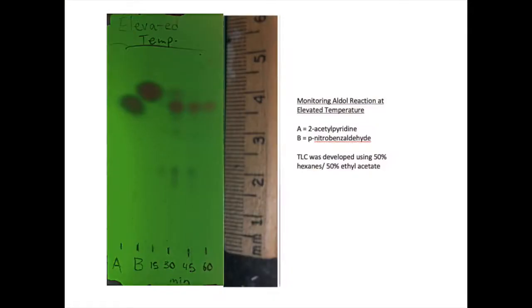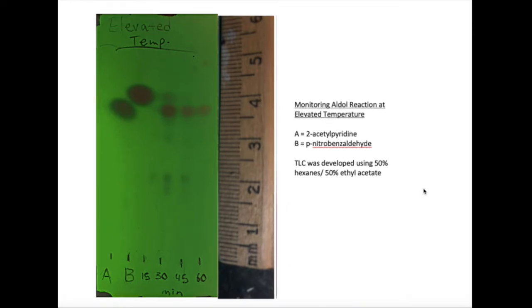Here's what that TLC looked like once it was fully developed. We visualized it by UV light. On the first column, we have 2-acetylpyridine. And then second column, we have p-nitrobenzaldehyde. And then we have lanes at 15, 30, 45, and 60 minutes. For that 15 minutes, it's kind of hard to tell what's really going on. Maybe there's a little bit of an overlap with the starting materials. But then you can see that there's a small amount of something that's starting to form at the bottom. And then once 30 minutes has passed, you can see that there's clearly a major spot at the top. And the spot at the bottom doesn't seem to be getting much bigger throughout the reaction. And then it looks like it actually goes away after 60 minutes. So it looks like there's a major spot forming at the top. And it's kind of close to the 2-acetylpyridine. But later on, you'll see that it's actually a different product.